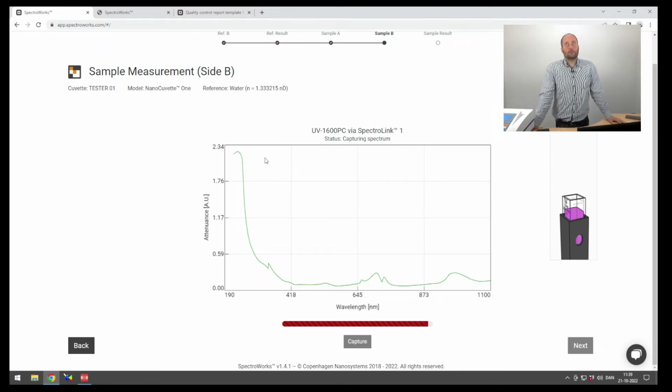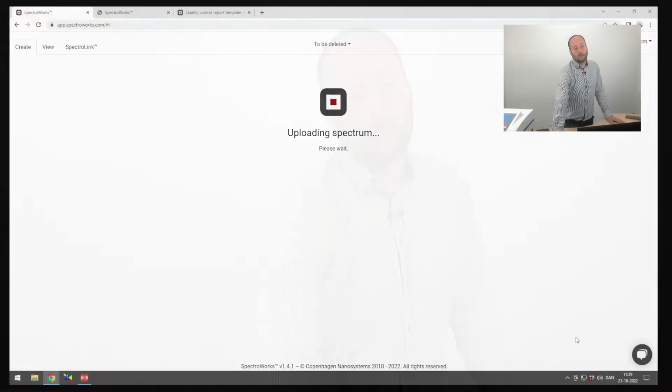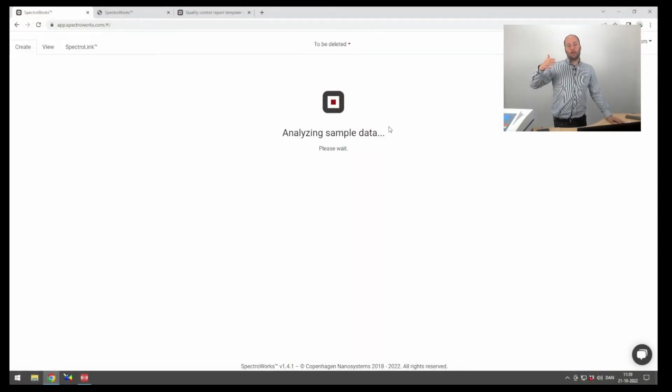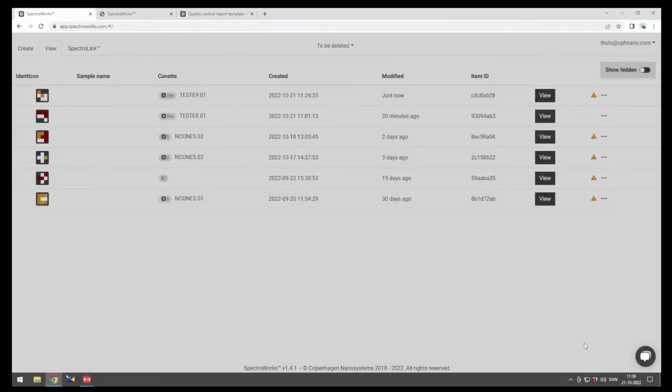Yeah, and also a very important thing is that the way we measure concentration is by volume. So if you do a volume concentration with us, and then you afterwards measure the relative density, then you can calculate how porous your titanium is.